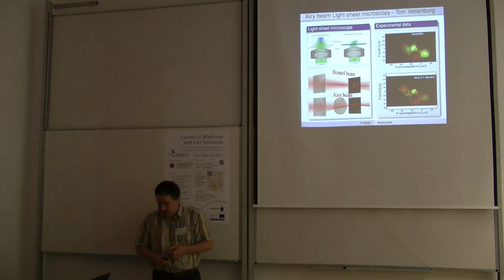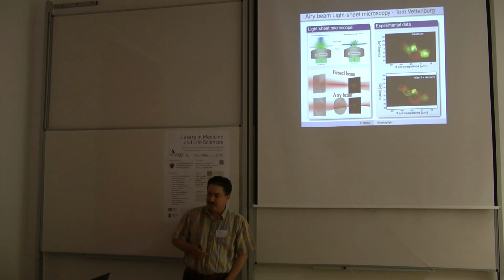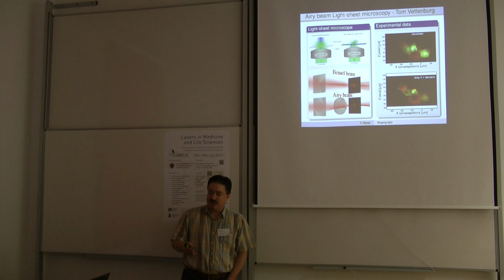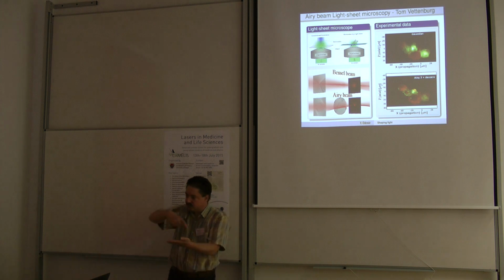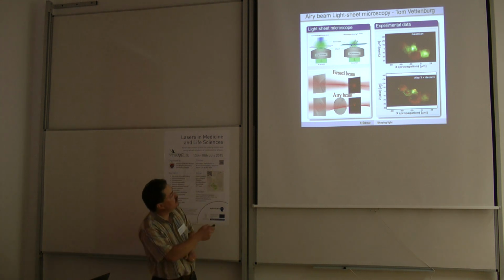Now the other application, this is sort of a step aside. You may or may not have heard about the light sheet microscope, which is now very, very powerful and very popular in life science imaging. It's sort of an equivalent of the confocal microscope. It also gives you volumetric imaging, but instead of raster scanning the 3D scene with a spot and rejecting the light that is out of focus, you basically only illuminate your sample with a plane from the side.